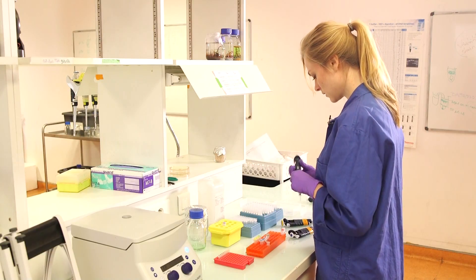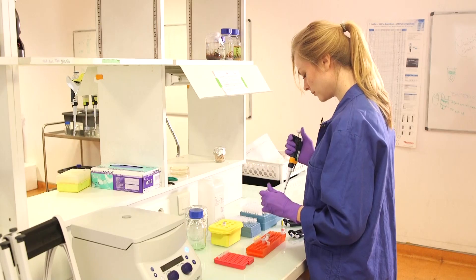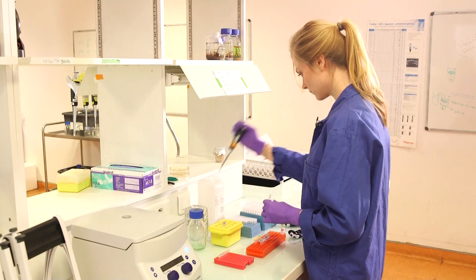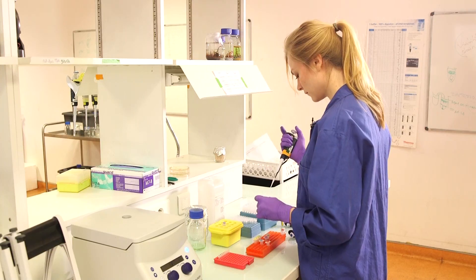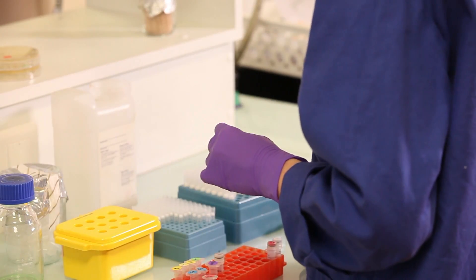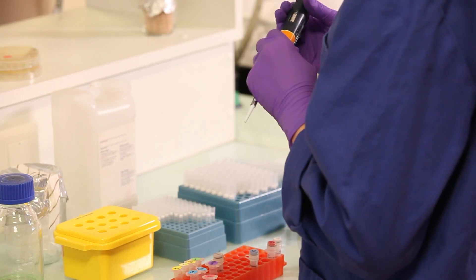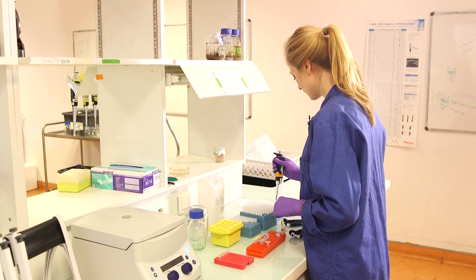I also need to add our primers: 12.5 microliters of each primer — so the forward primer and the reverse. And of course the polymerase — 2.5 microliters — which should be sufficient for all the reactions that I will do.